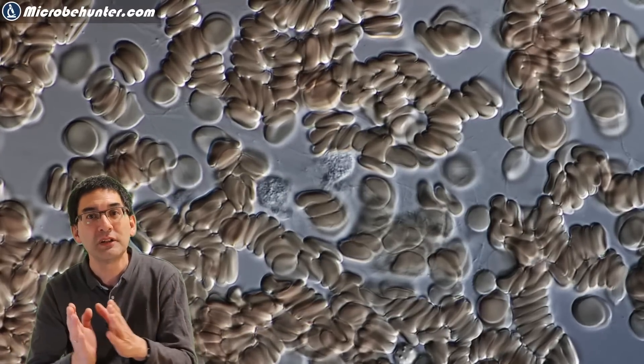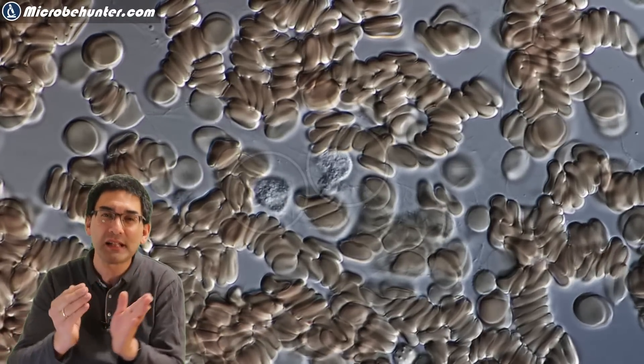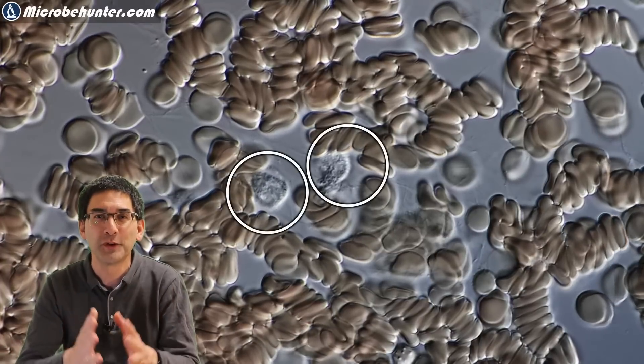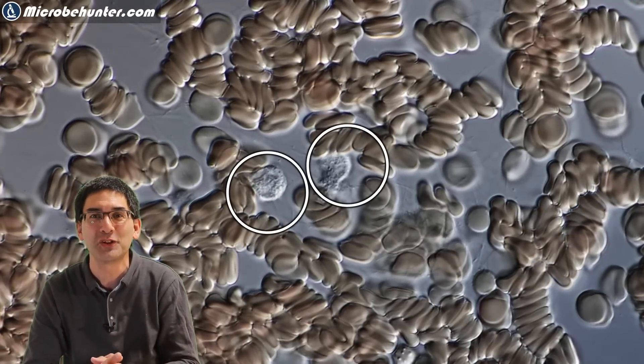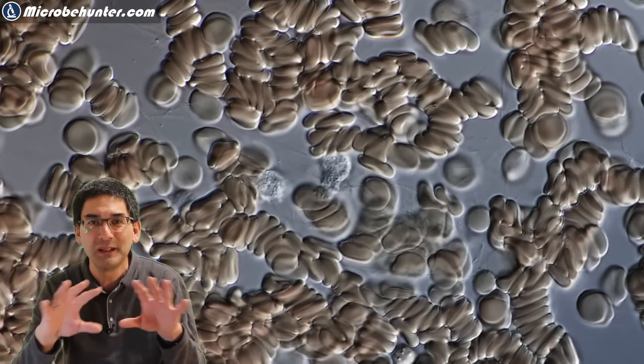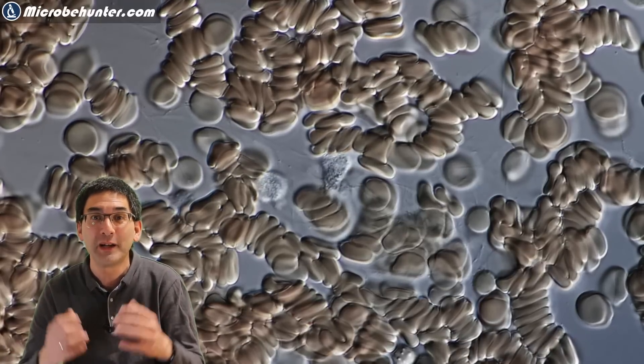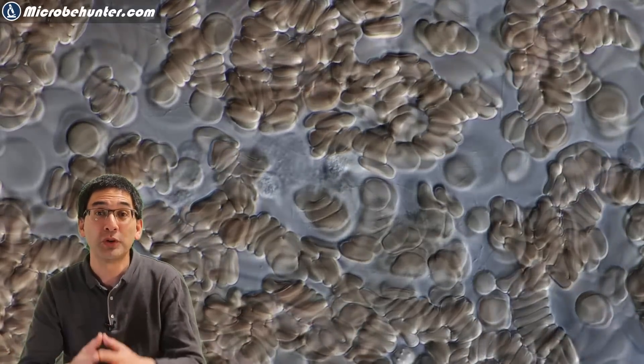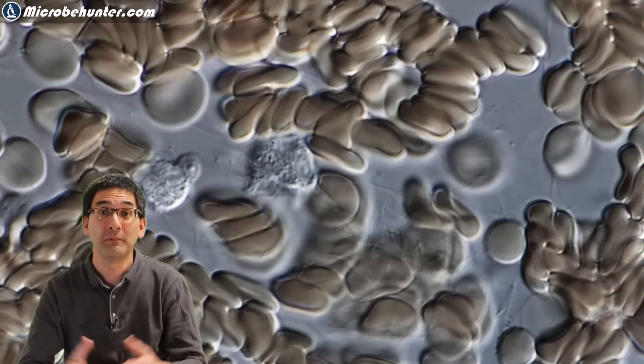It's quite fascinating how flexible they can be, able to squeeze even between the cells outside of the blood vessel. Here, for example, there are two of them right next to each other, moving around and scavenging the area trying to find bacteria.